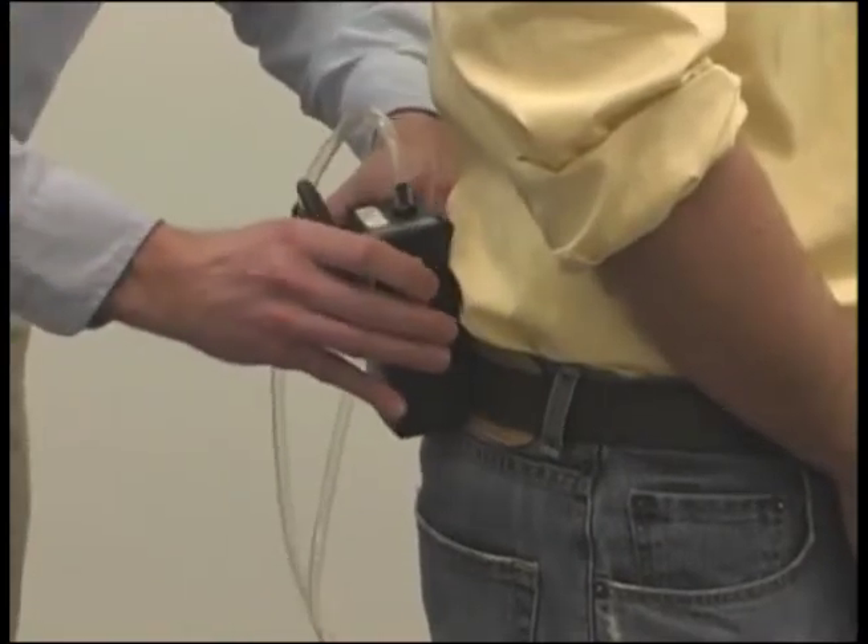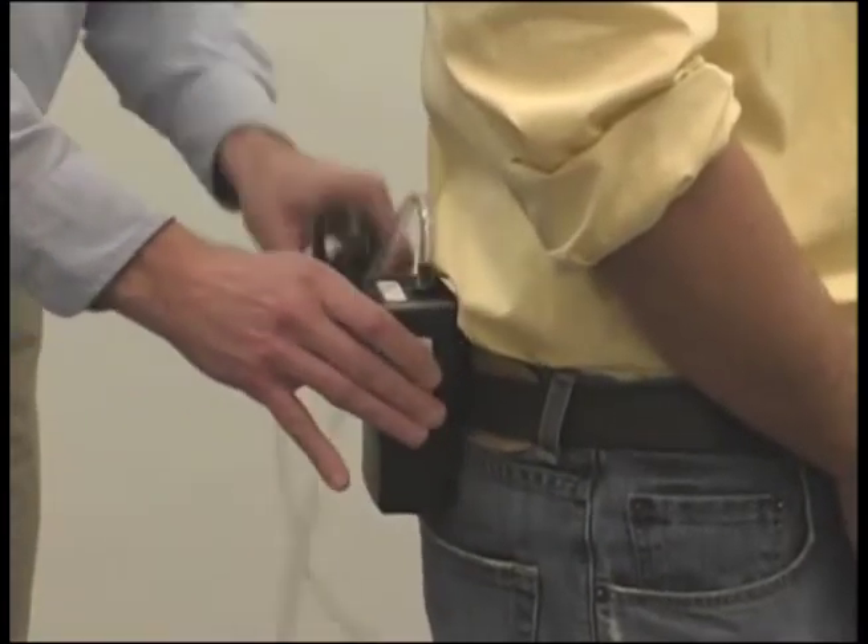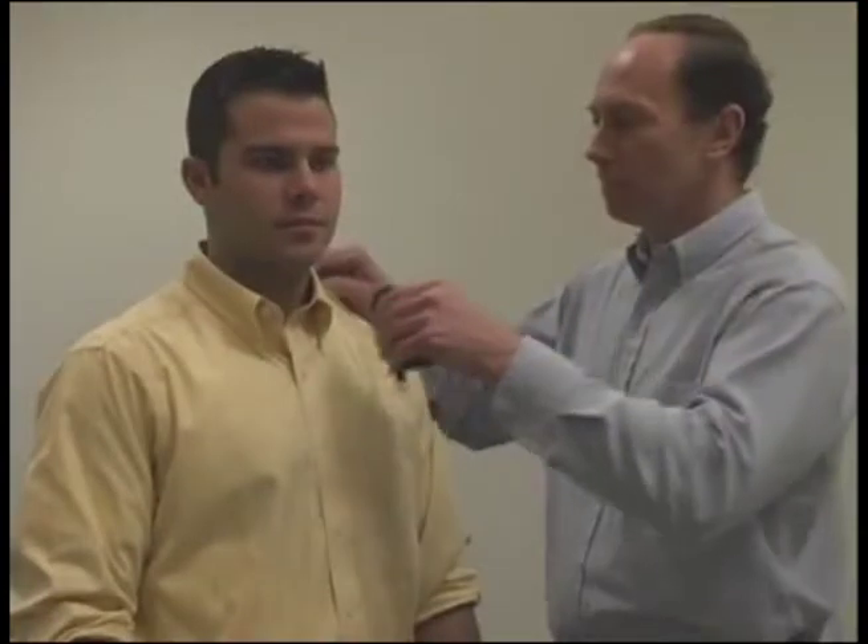To begin sampling, attach the pump to the worker's belt or pocket, either in back or on the side.